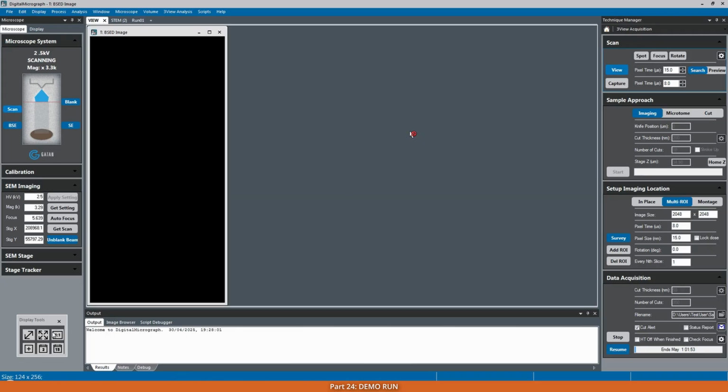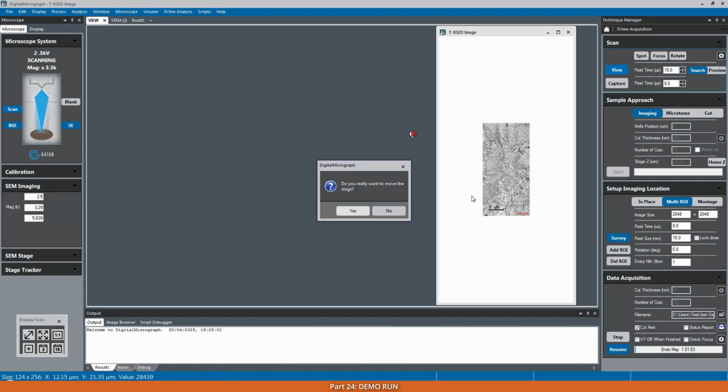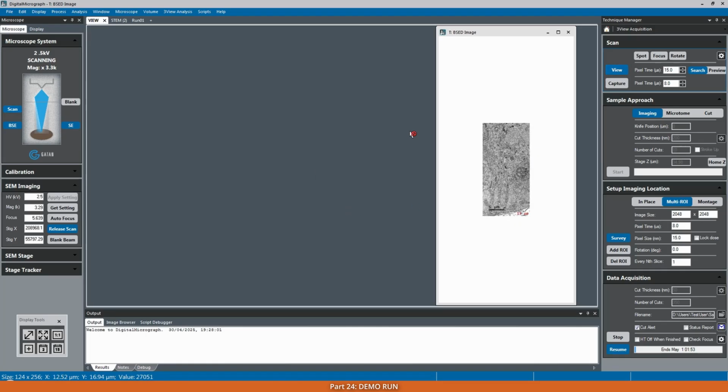It's important that I hit the pause button when the imaging of the previous slice is going on. You shouldn't press it when the microtome is cutting. If you pause the run while imaging is going, you can after that go to any locations for focusing, like I'm doing now. And then when I resume the run, the view will automatically jump back to my position. If you pause the run when the microtome cuts, then the first images that you collect will be at the wrong place.